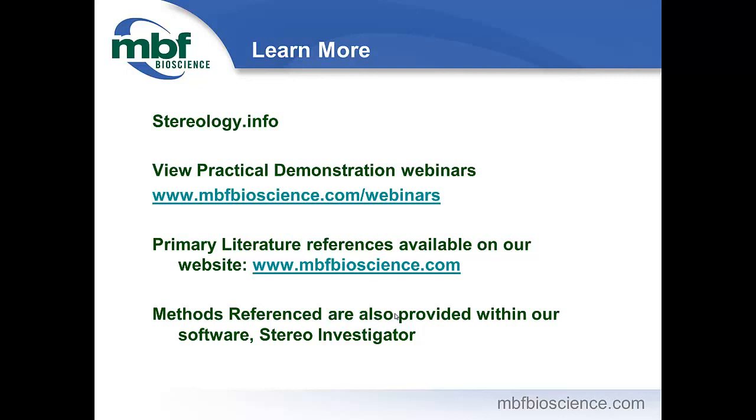The practical demonstration webinars cover how to implement the optical fractionator in Spaceballs, as well as Cavalieri and area fraction fractionator. You can refer to the primary literature in order to see how researchers in your field are using stereology to obtain unbiased quantitative estimates of their feature of interest. And we also have how the methods were developed as references within our software, Stereo Investigator.